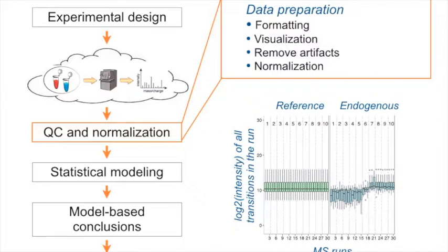So we recently had a situation where, for some reason, they didn't spike them in the same concentration. So then you can still use them to calibrate your retention time, but you cannot use them anymore to calibrate your abundances. So it is possible, because it's like any other standard pretty much, but then you have to be careful that you spiked at constant concentration. And again, remember that it only accounts for technological shifts which occur after you spike in. So it still doesn't help you with all the upstream effects.